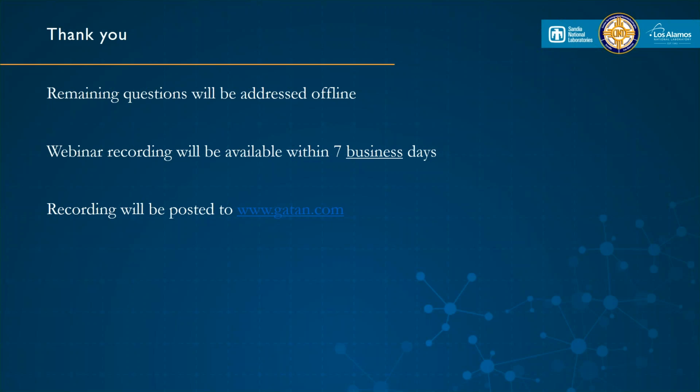Let's see. Another question that we got: in slides 31 through 32, there's some drift of the region of interest, or ROI. Is the ROI tracked automatically by the software? So there's a few, especially in this new user interface of GMS, different types of tracking algorithms. Those ones were just kind of the first I tried.